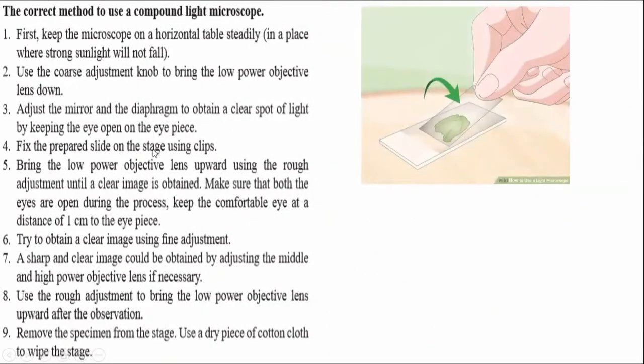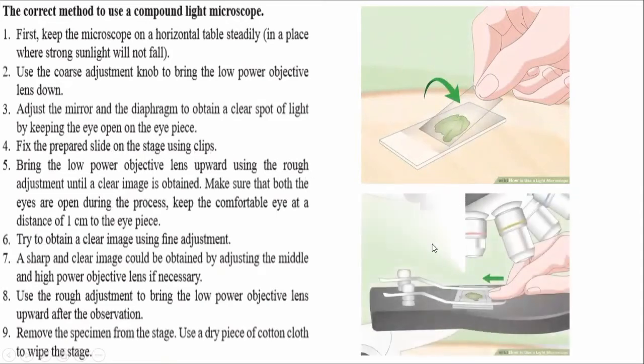Fix the prepared slide on the stage using clips. All right, so that is pretty simple. You can see that we have made the specimen here, and now by using the stage clips, we have fixed the specimen on the stage.